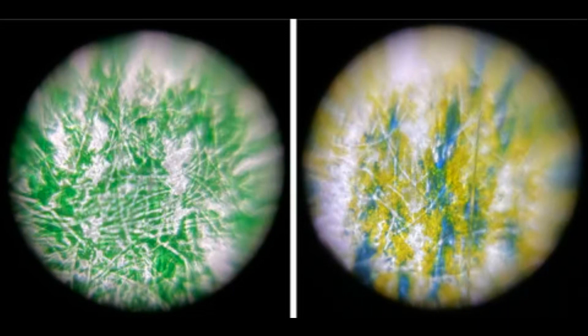While the magnified green image shows only green pigment, the mixture clearly reveals spots of both yellow and blue pigment next to each other. Colored pencils allow for a lot of the individual paper fibers to be seen because the pigment doesn't coat them very heavily.